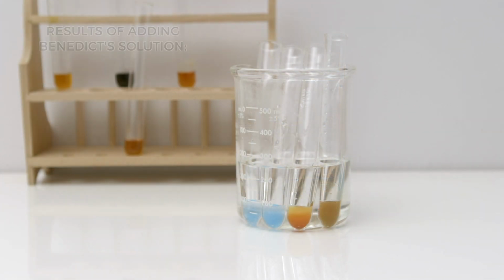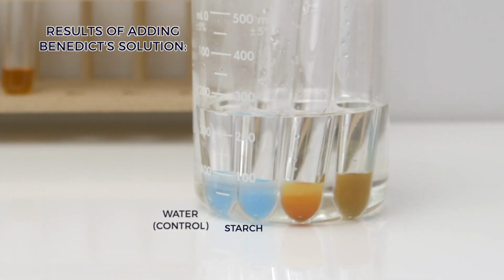After a few minutes, we observed that the first test tube with water remained blue, the second test tube with starch remained blue, the third test tube that had glucose turned a bright orange color, and the last test tube with the beaker solution turned a dark orange. The fourth test tube is darker because the solution from the beaker was already amber.